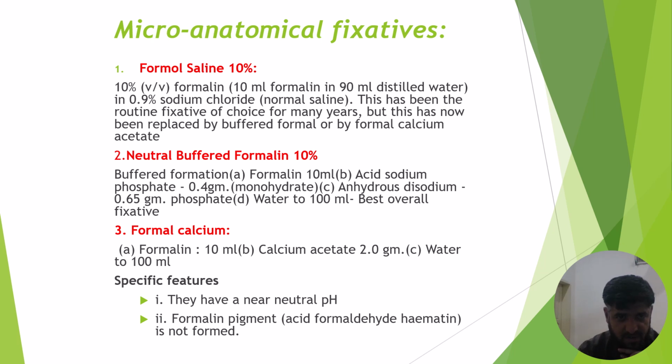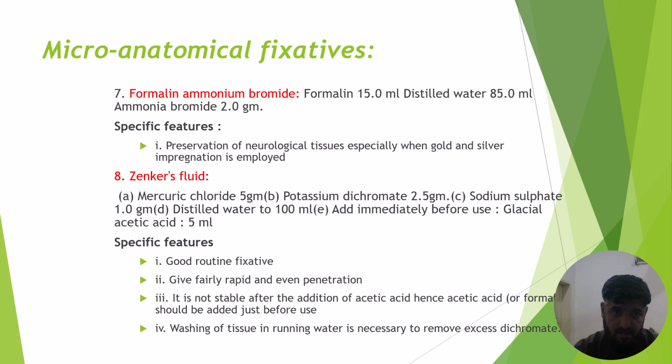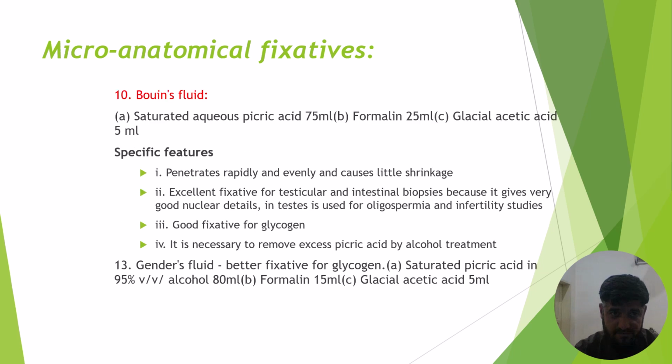Other microanatomical fixatives include neutral buffered formalin, formal calcium, buffered formal sucrose, alcoholic formalin, acetic alcoholic formalin, formalin ammonium bromide, Zenker fluid, and Zenker formol, that is Helly's fluid. So these are some of the microanatomical fixatives.